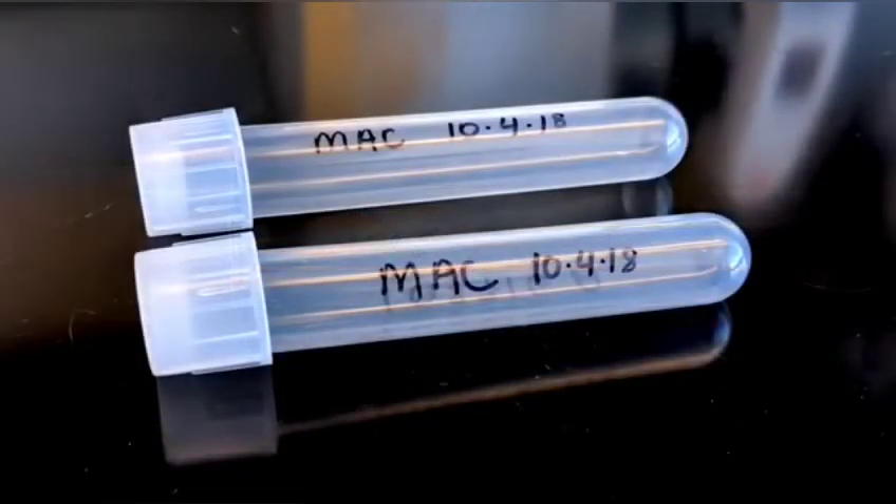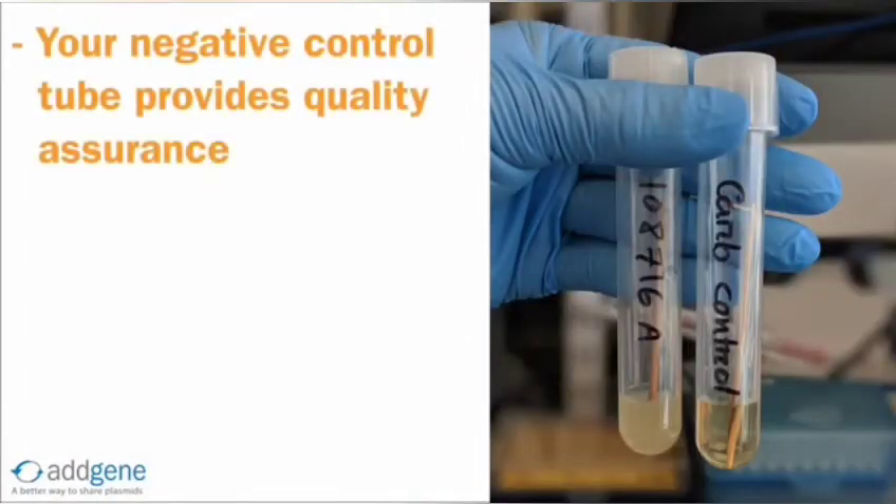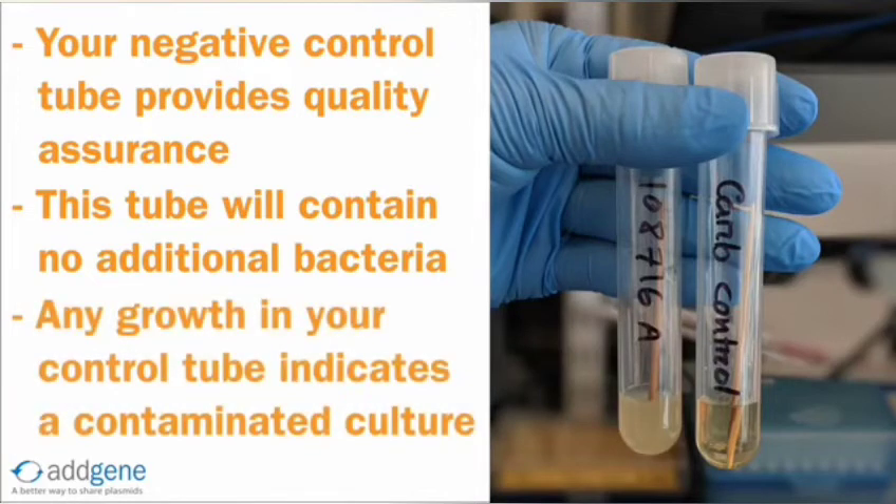It is also a good idea to add your initials and the date to the tubes. Your negative control tube provides quality assurance when growing liquid cultures. The negative control tube is your fake inoculation tube, and will contain liquid media, antibiotic, and the toothpick used for picking, but no additional bacteria. If there is any growth in this tube the next day, this indicates that a contaminant was present, and therefore you cannot trust any growth observed in the culture.